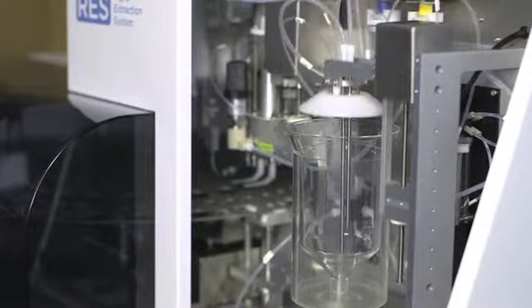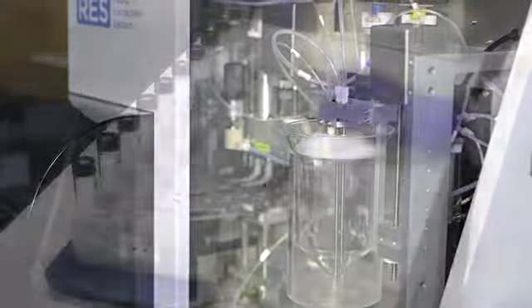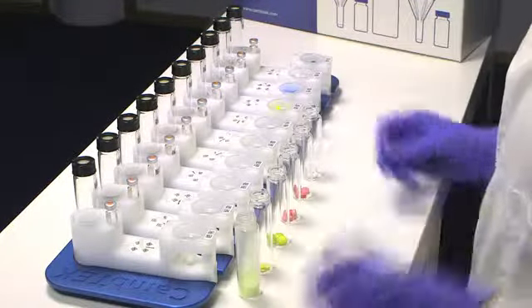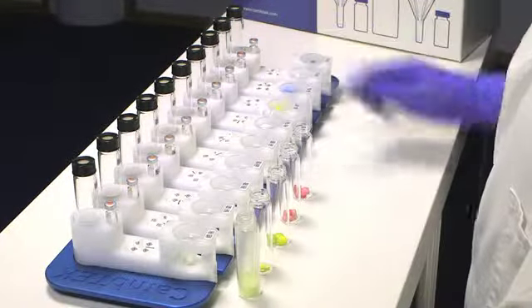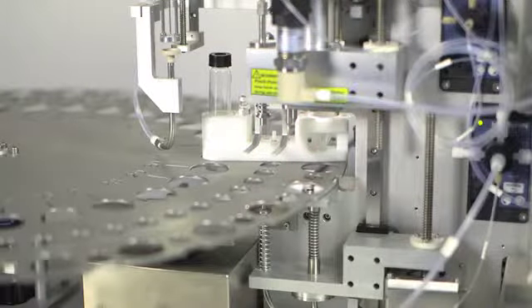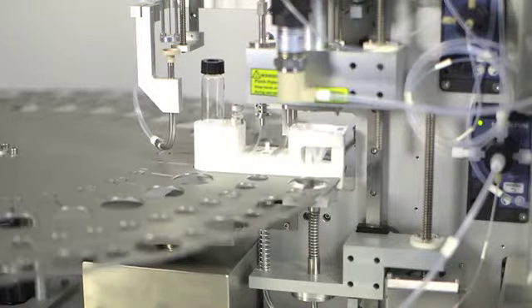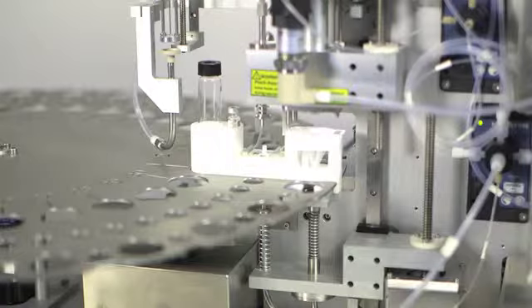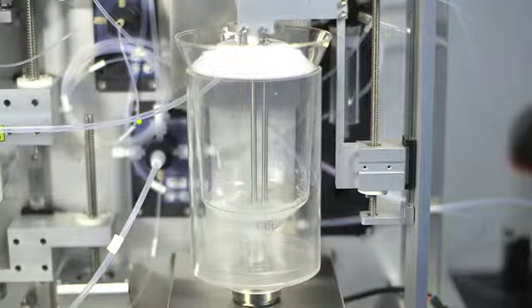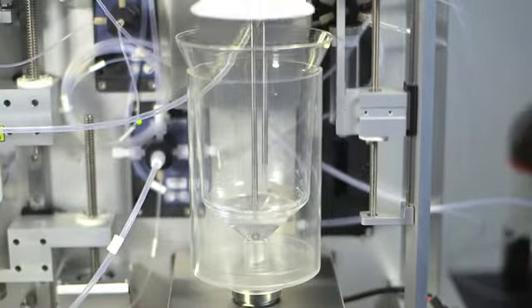Minimal setup and user touch time is required, and the 30-sample batch load facility allows for meaningful analyst walkaway time. With its intelligent design and high-quality components, the RES can run tests 24-7, minimizing downtime and maximizing laboratory productivity.